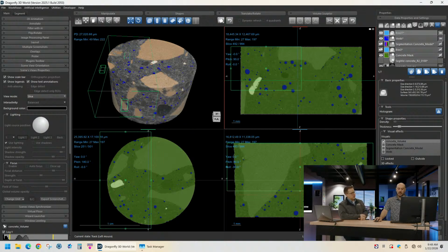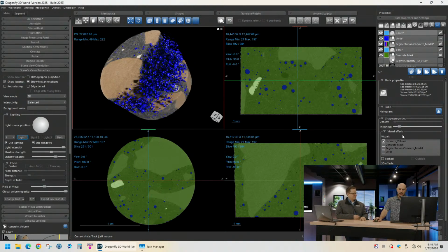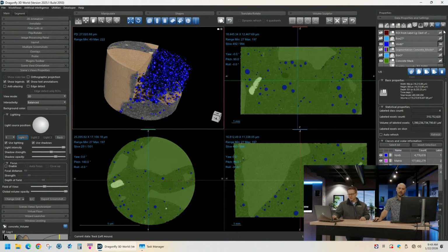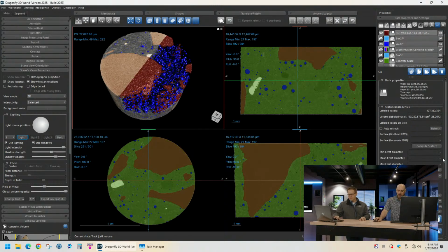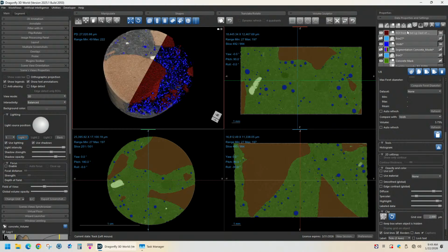Right, exactly. And you can make those really cool pictures like the one that we had for this episode. So here's our voids extracted. And then let's extract the large class. We can do that in 3D. So also for these, we can change diffuse, specularity, highlight, just some of the things I like to do.